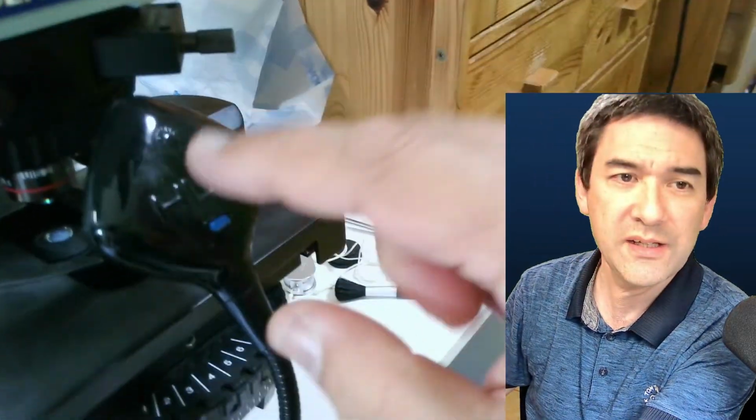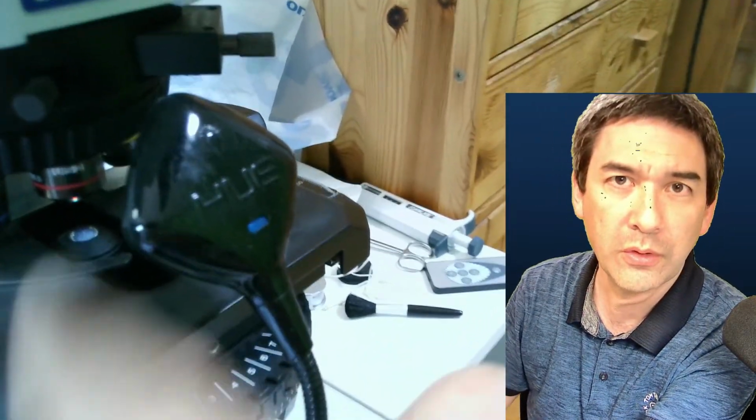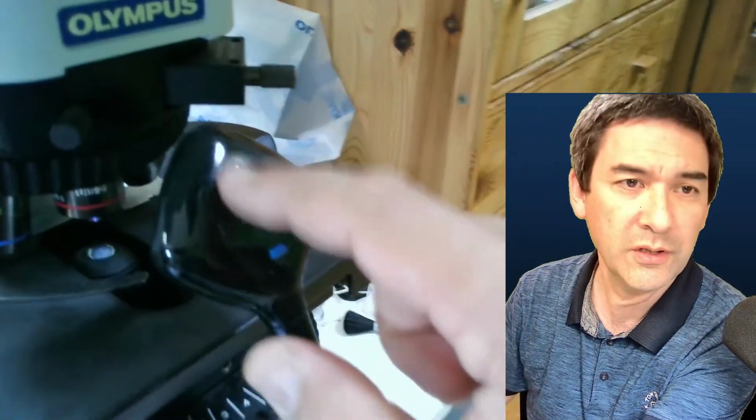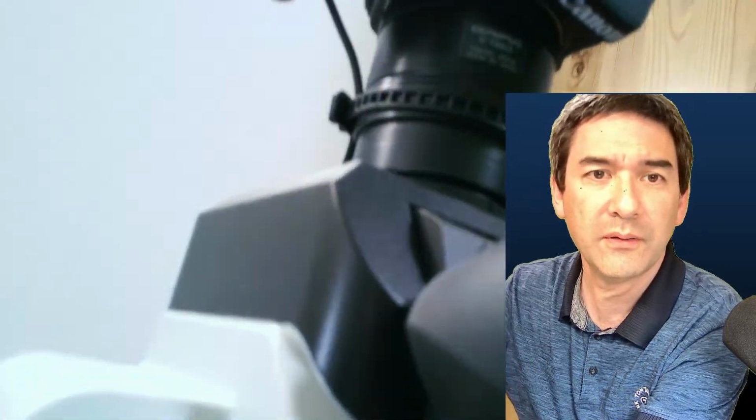So these are the eyepieces here, right? And on the bottom, I'm also going to show you this here. This is the other camera, which basically shows you the view of the stage when you look through the microscope. This camera over here captures the one that you see up here. You see if I bump it, then it shakes. So that's kind of the way it's connected.